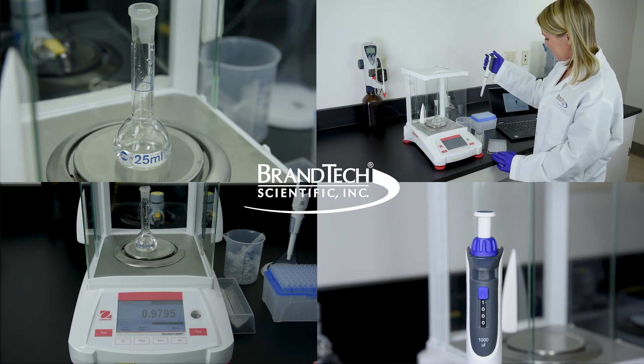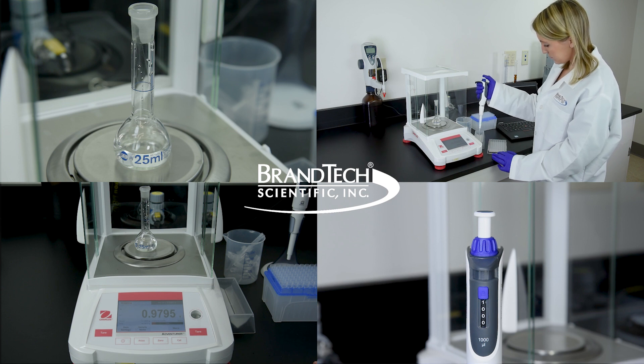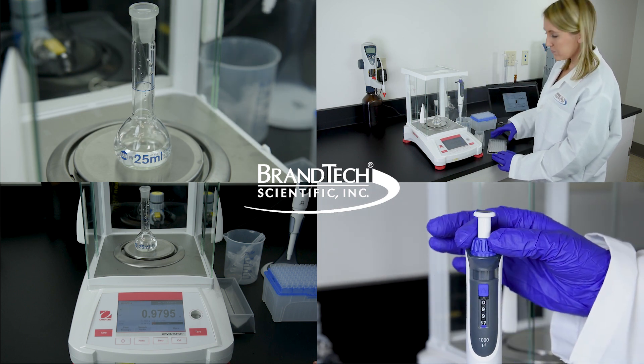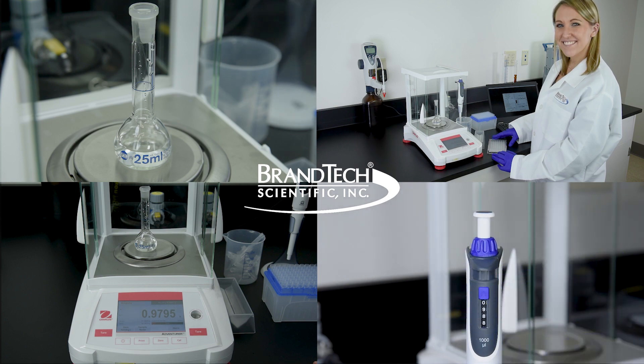Regular calibration of liquid handling equipment, as specified in ISO 8655, provides reliable processes and results in the laboratory. Brand's easy calibration feature allows easy adjustment within seconds and without tools. Let us demonstrate how fast and easy easy calibration works.